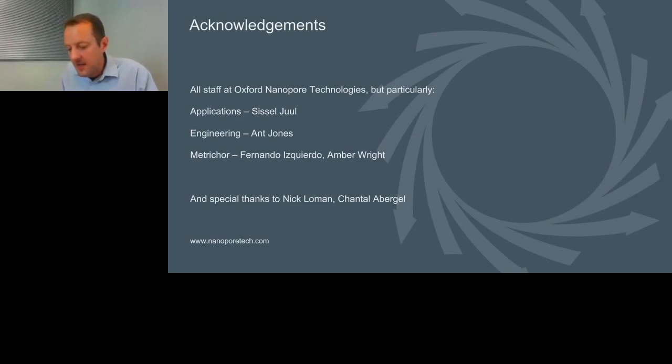What I can say is that when a strand passes through the nanopore, we see it. The question is more how we can make sense of it. And so the easiest thing, and what I showed in the slide, is that if you have a modified strand and an unmodified strand, and you overlay the squiggles from those, you can see a difference. And that tells you that there is something there that is not matching with the base call model that we're using. Now, if we knew what the base should have been in that position, and we then see that we've got a deviation from that, it implies that there is a modification there.